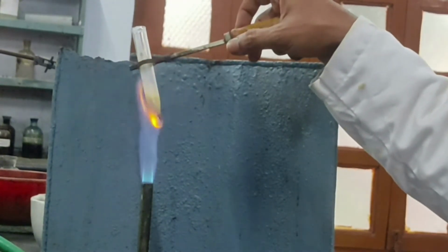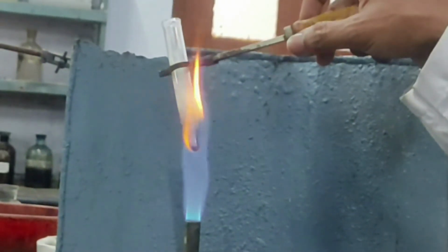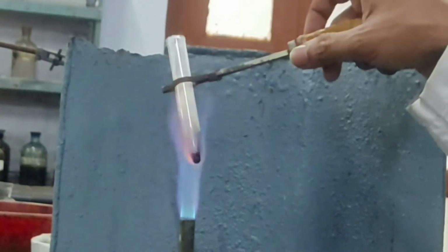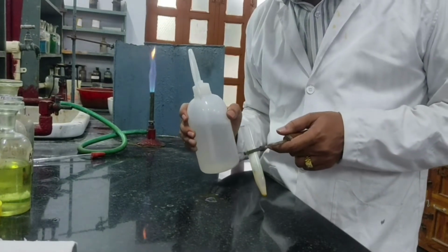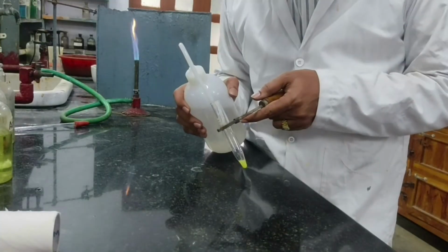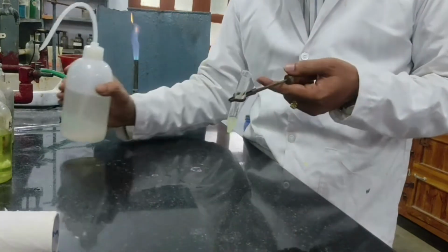Not only that, it is heated to dryness. Now this is to be cooled. After cooling, this is to be dissolved in a minimum amount of water. I am adding a little amount of distilled water.